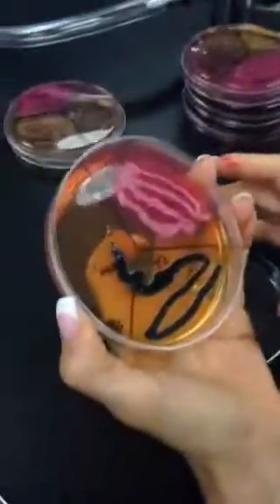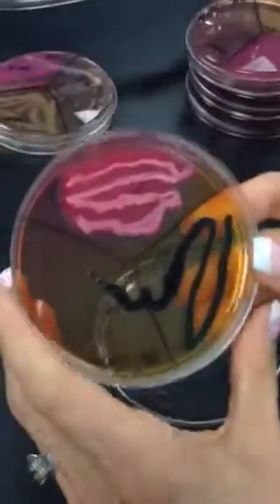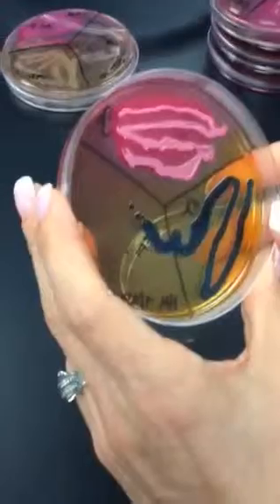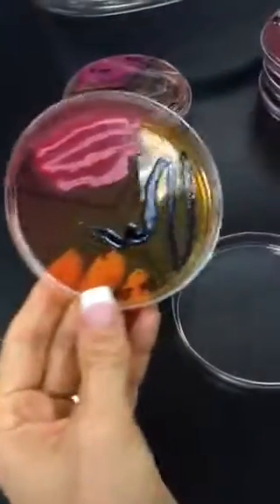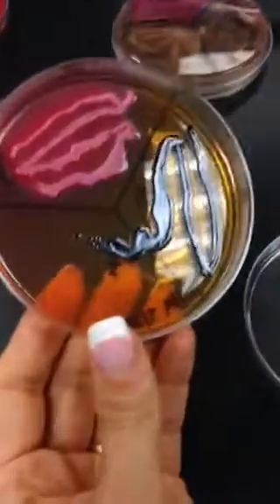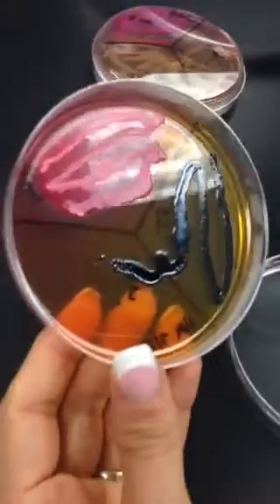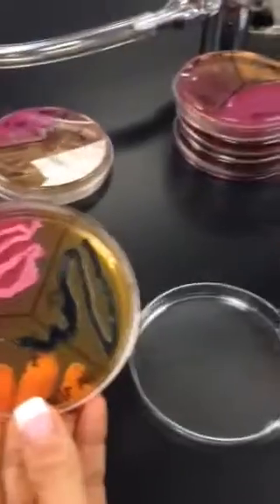Shigella salmonella agar is specifically made, and they don't really use it that much anymore, they have other agars they use instead. But it's specifically made to show you when you have salmonella or shigella, which are unfriendly. Shigella probably come from fish poop, salmonella from chicken poop. These are harmful, cause food poisoning for us. They are enteric flora, but not for us, and they can be pathogenic if we ingest them.